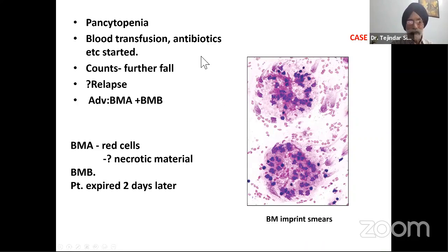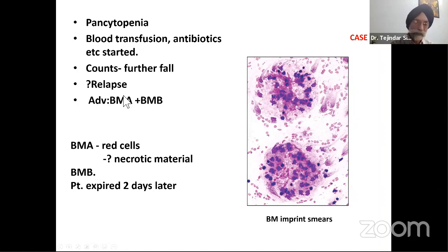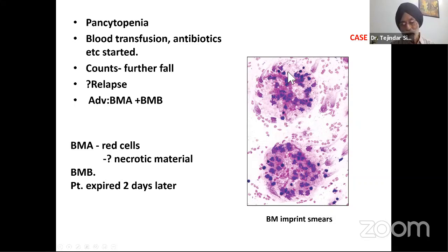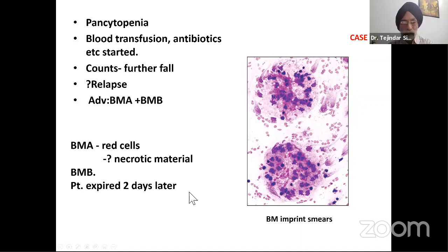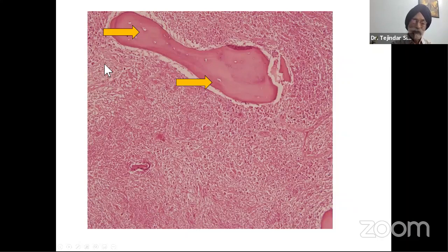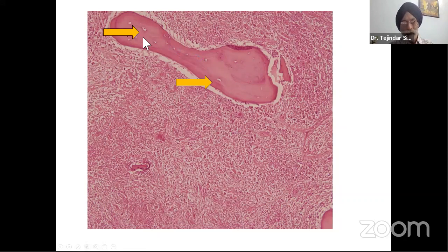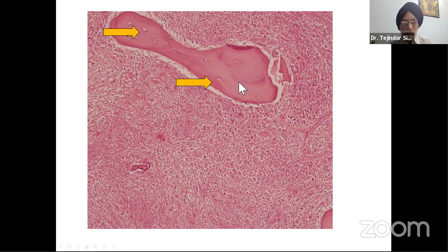On bone marrow aspirate, the cells were necrosed — morphology not well made out, nucleus broken, cytoplasmic borders broken. Some red cells were in between but blast cells could not be seen. We thought this could be necrotic material. The patient expired two days later. The bone marrow trephine biopsy showed massive necrosis of the bone marrow — not only of the hematopoietic tissue but of the bony trabeculae also; osteocytes were not seen in the lacunae. This was a case of bone marrow necrosis.